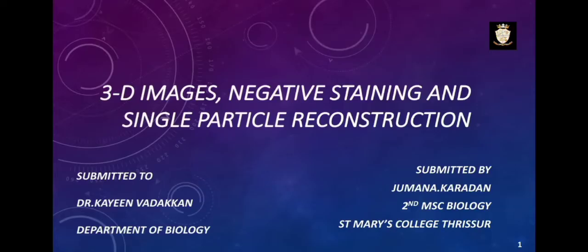Hello everyone. Today we have to discuss the topic 3D images, negative staining and single particle reconstruction.